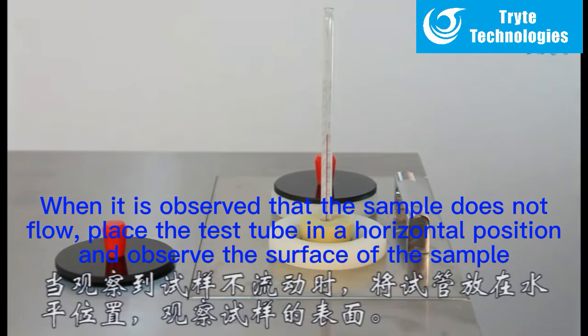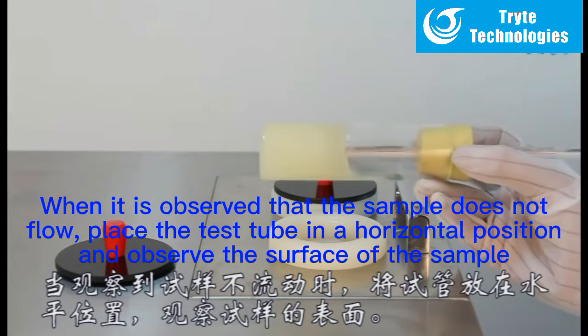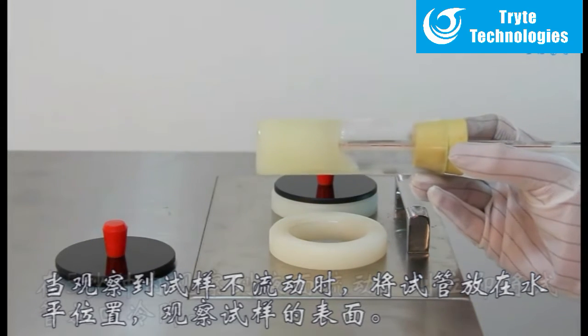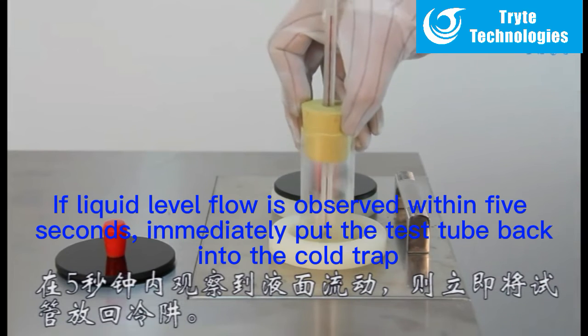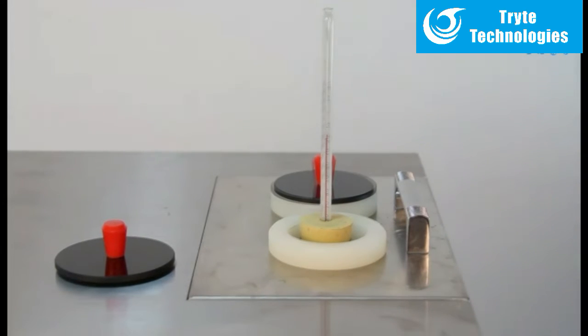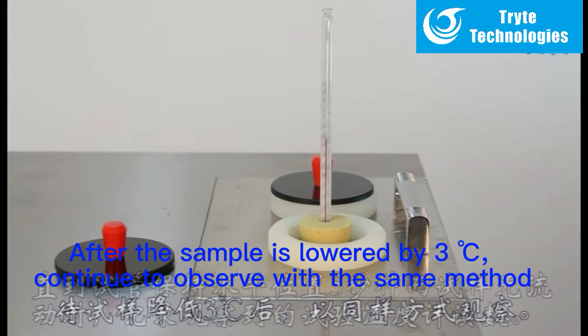When it is observed that the sample does not flow, place the test tube in a horizontal position and observe the surface of the sample. If liquid level flow is observed within 5 seconds, immediately put the test tube back into the cold trap. After the sample temperature is lowered by 3 degrees Celsius, continue to observe with the same method.